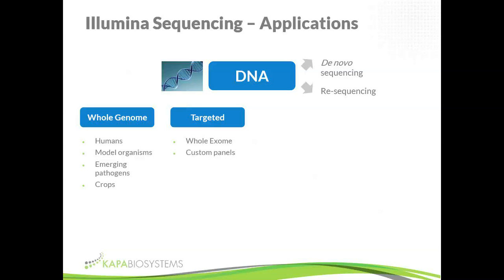And so for instance, we can look at all the genes associated with certain diseases. In the clinical world, they talk about actionable panels nowadays. So these are regions of the genomes that are associated with known treatments or treatments that are in trials at the moment. So lots of different ways of looking at smaller subsets of the genome that are cheaper, easier to turn around, and provides more targeted and actionable information.